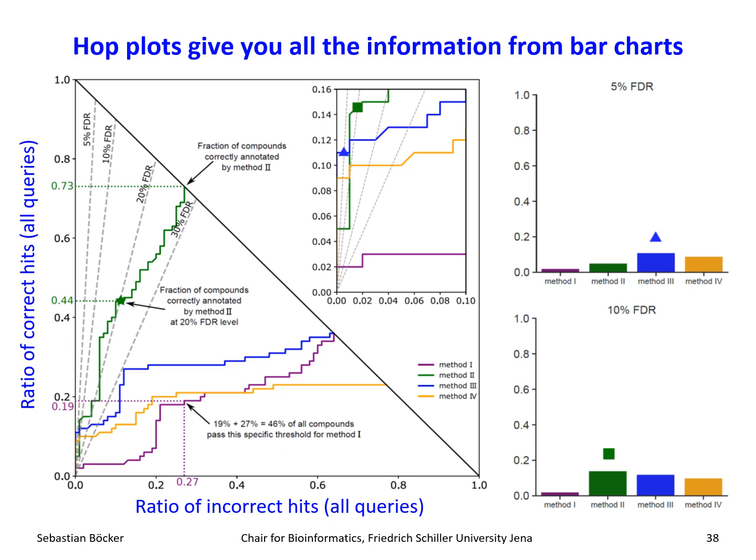This will rarely happen in practice, so it's more a theoretical thing. Okay. But all of these other bars are also contained in here, and we also have those things contained in here which are not shown in any of those plots. For example, you can think of 15% FDR. Just put a ruler here, and then you will see where it actually intersects those lines.